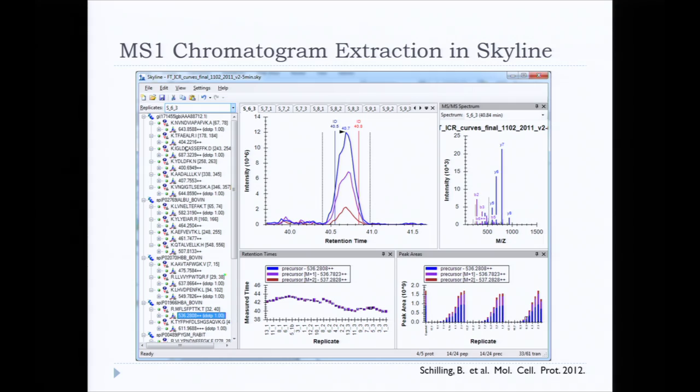So Skyline actually annotates the chromatograms now with identifications from your spectral libraries that correlate to the data you've actually imported, whereas we have been building spectral libraries from completely different data sets and then importing new data sets. In this case, we're building a spectral library and then importing that same data, and that allows us to annotate the chromatograms in that data, saying, look, we had a peptide identification for this MFLSFPTTK peptide, and we had one here and we had one here.